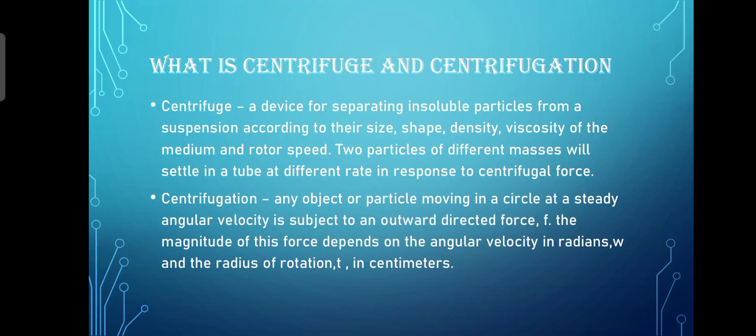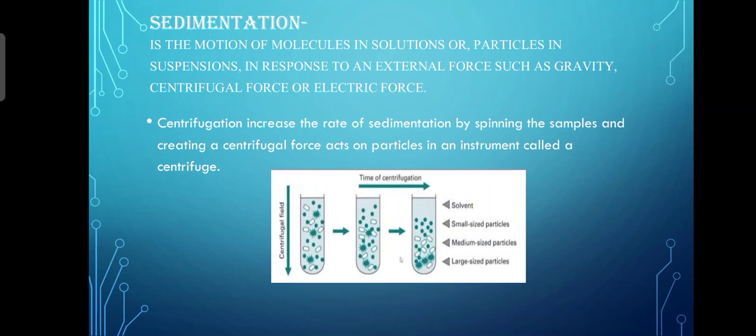The more dense component of the mixture migrates away from the axis of the centrifuge, while less dense components of the mixture migrate toward the axis. Sedimentation is the motion of molecules in solution or particles in a suspension in response to an external force such as gravity, centrifugal force, or electric force. Centrifugation increases the rate of sedimentation by spinning the samples and creating a centrifugal force that acts on particles in an instrument called a centrifuge.